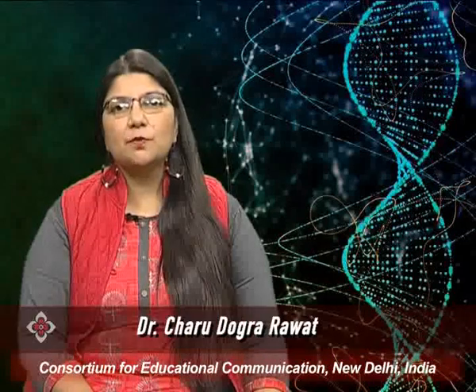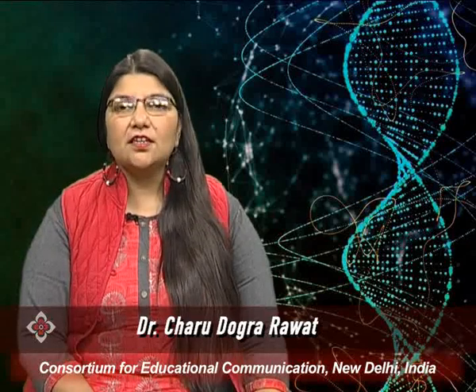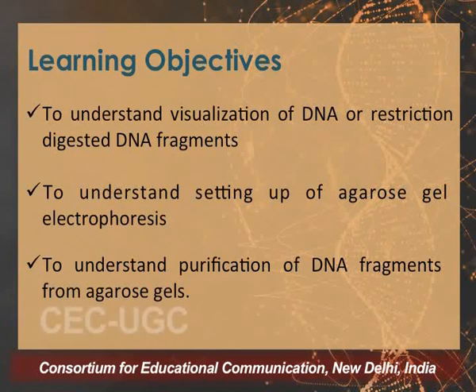Hello students, in continuation with the Recombinant DNA Technology series that we have been doing, today I would be talking about the visualization of DNA and DNA fragments. The specific objectives for this lecture would be to understand the visualization of DNA or the restriction digested DNA fragments, to understand the setting up of the agarose gel electrophoresis, and to understand the purification of DNA fragments from agarose gels.